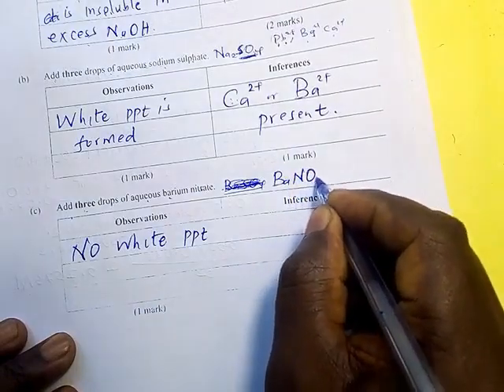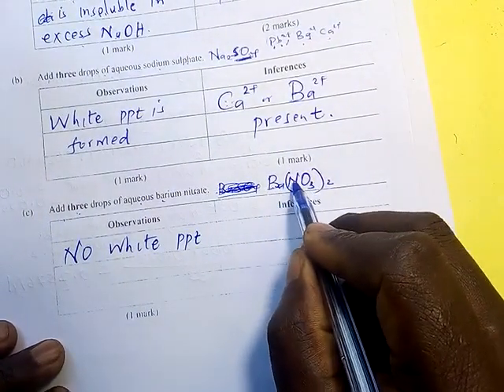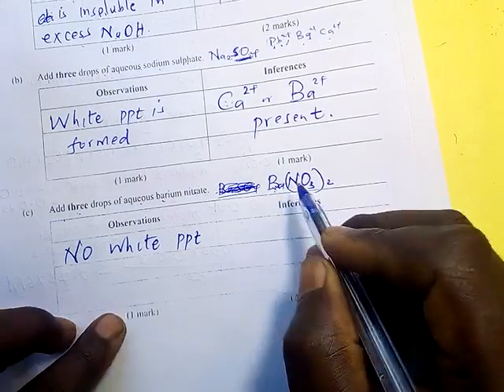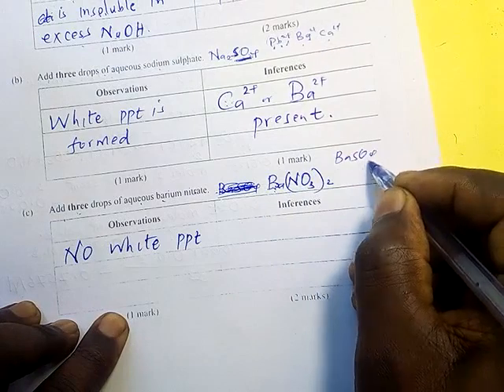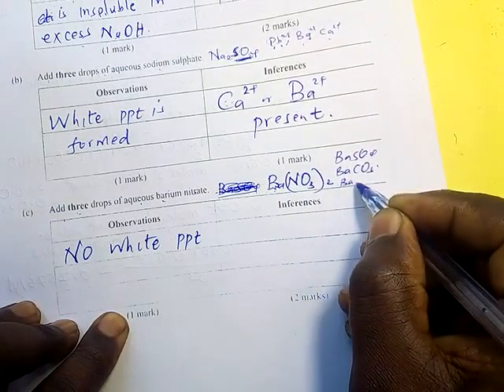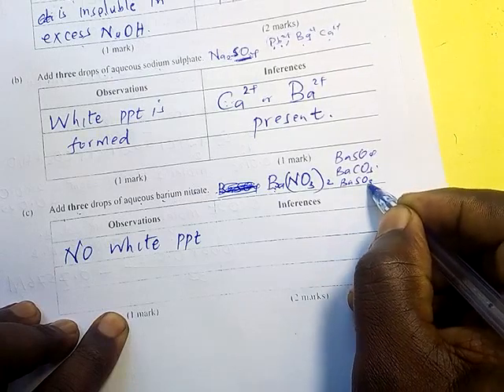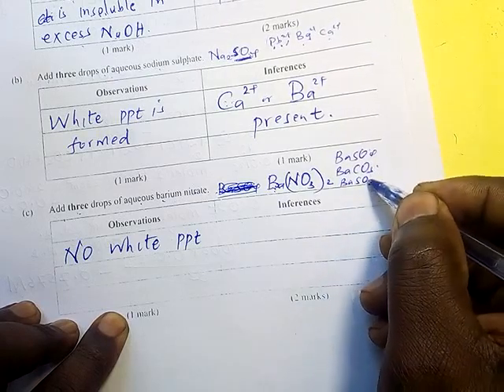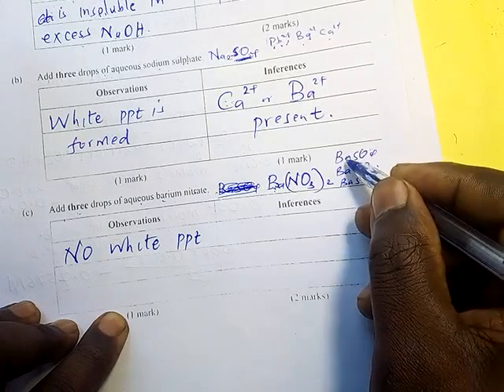Sorry, barium nitrate. Whenever we are adding barium nitrate, we expect a white precipitate because barium will form barium sulfate, barium carbonate, barium sulfite. These are the three salts or anions that will form a white precipitate with barium.